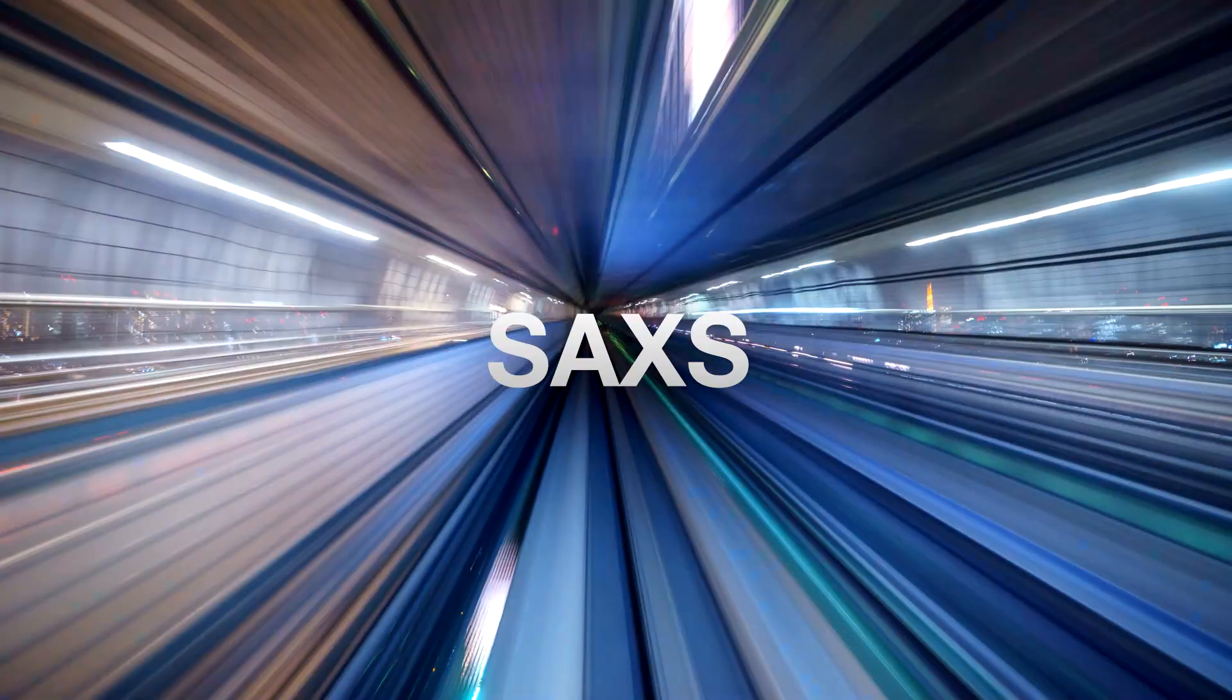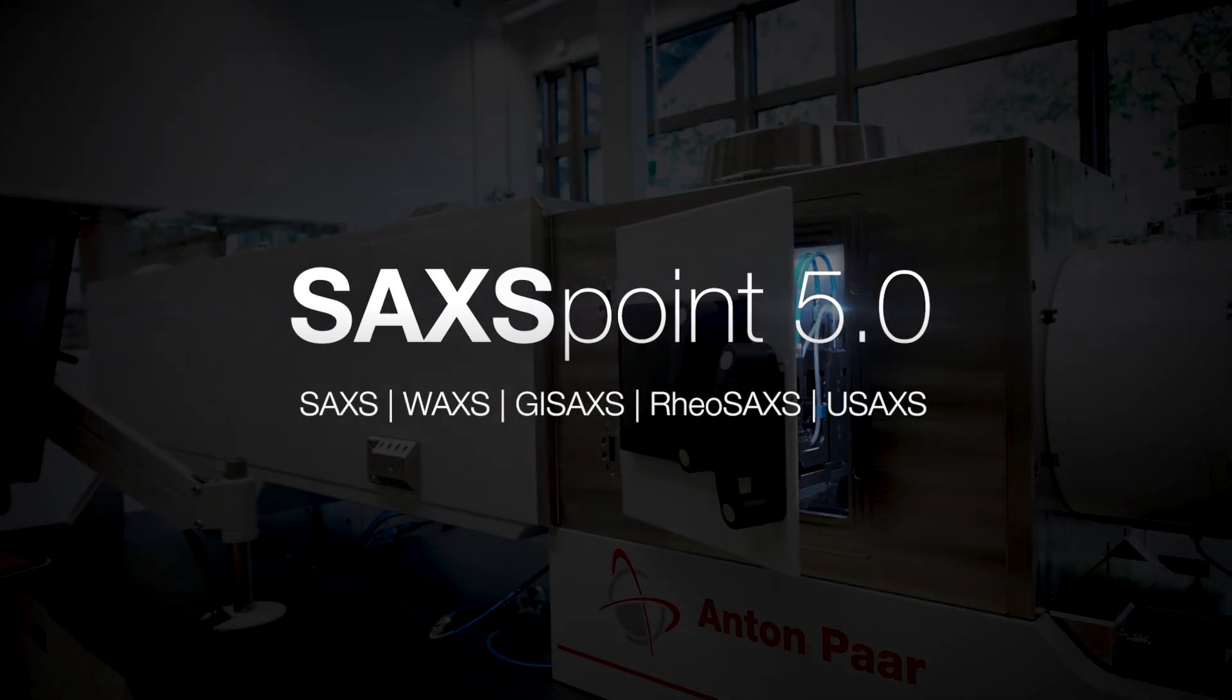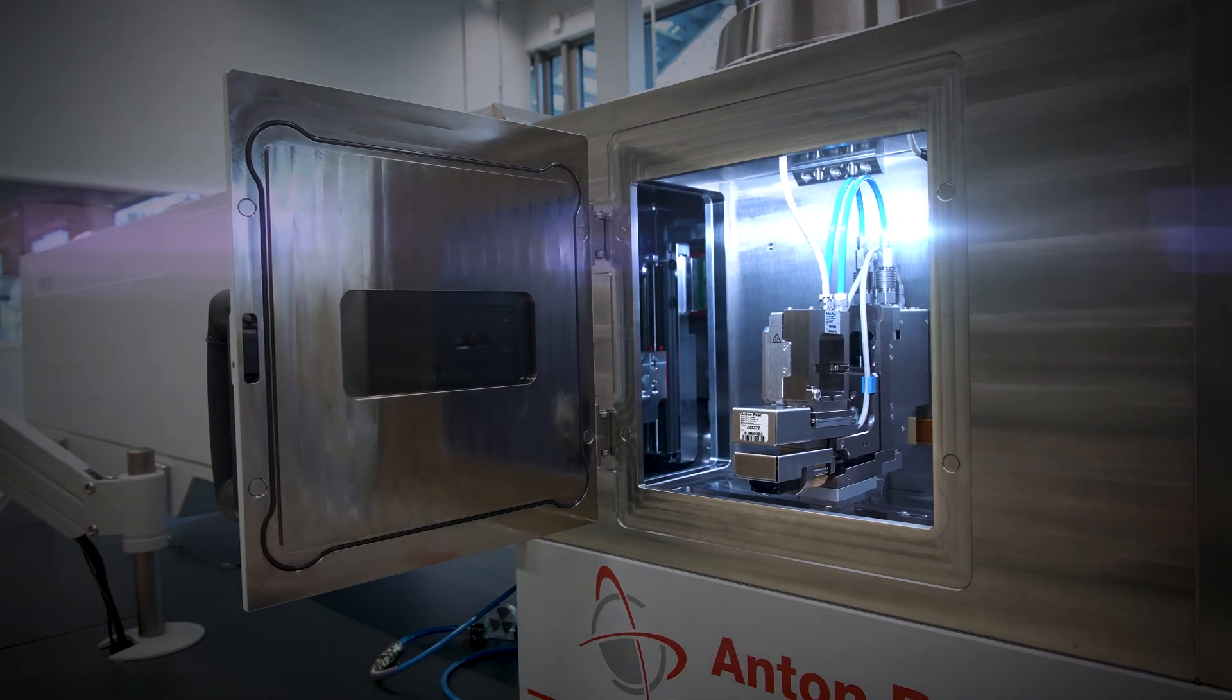SAXSpoint 5.0, the laboratory beamline for SAXS, WAXS, GISAXS, Rheo SAXS, and USAXS studies.